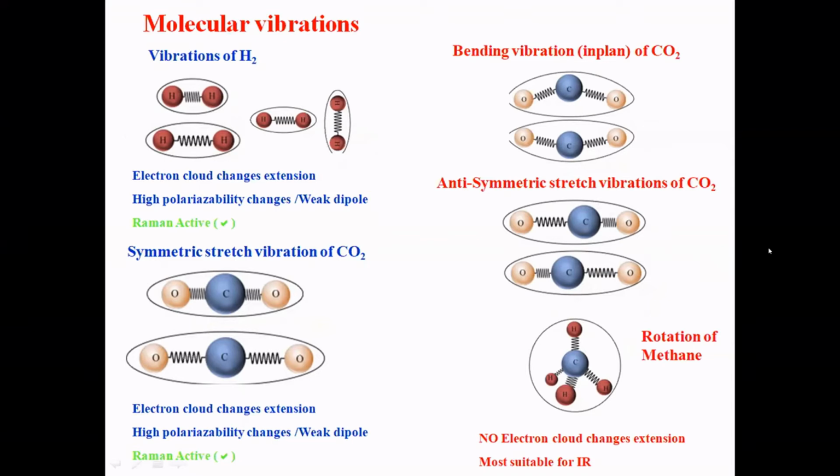These are just notations of different vibration structures. It's like atoms hanging on a string; it's not a stable, stiff bond. It keeps oscillating within the molecule. This is useful for shifting the electron clouds, or for creating a dipole within the atoms.